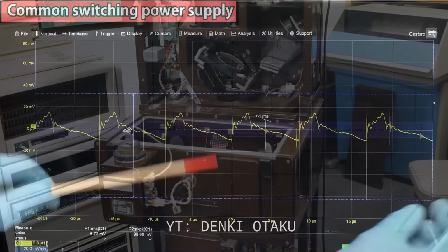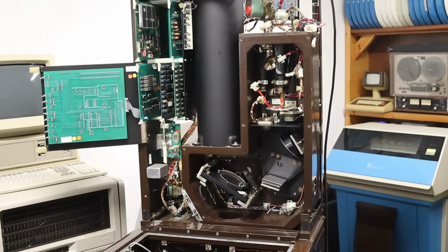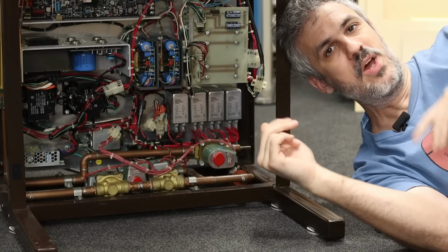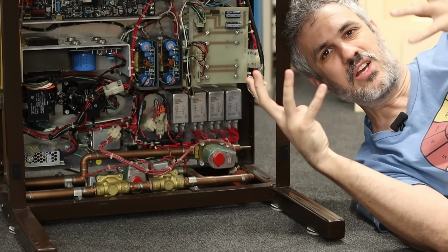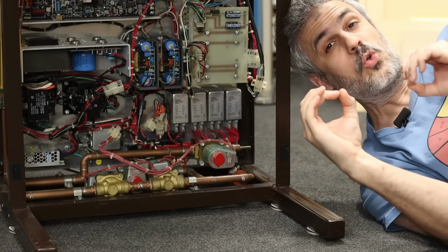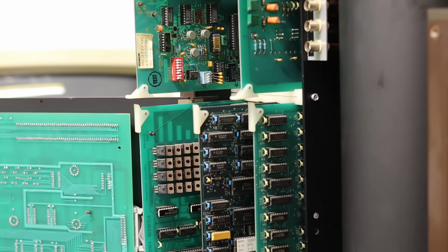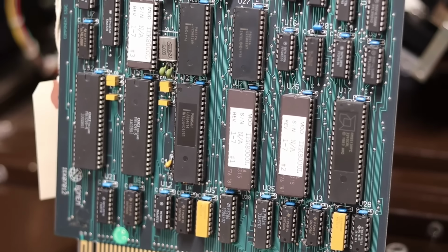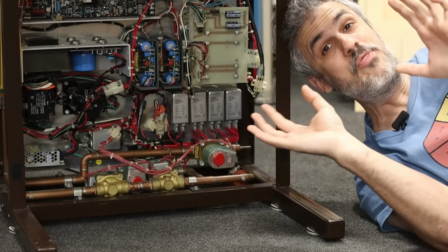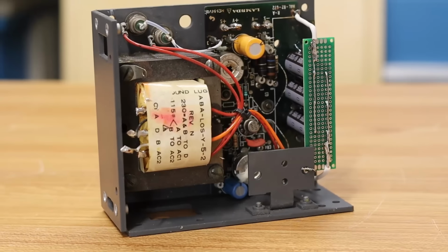That is something that we have to be aware of, because on a piece of very precise scientific equipment like this, sometimes you need extremely stable power that has zero ripple so that you aren't influencing the weird analog stuff that's going on within it. However, this 5-volt power supply that we replaced is solely for the 5-volt digital logic that's on the computer. It's not used for anything else. So I think we're going to be okay, but I am cognizant of the fact that there is some high frequency noise now being injected into the system, and there is a possibility that that noise could filter its way through and affect other parts. So we're definitely going to keep an eye on that.